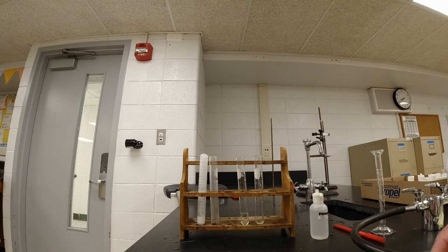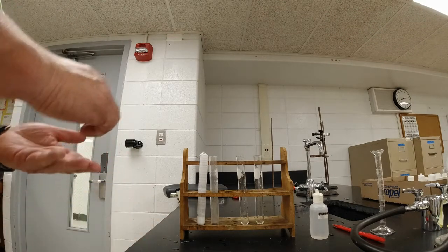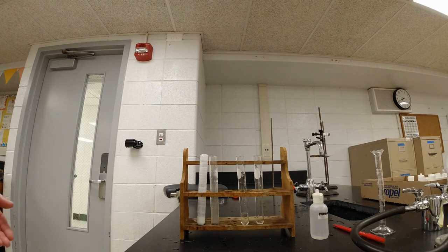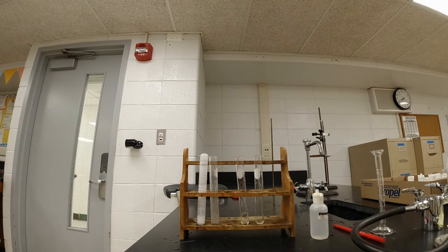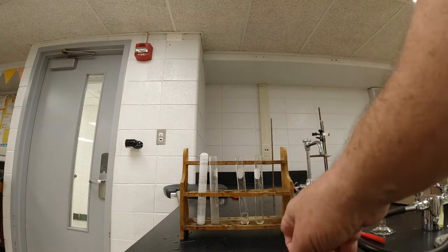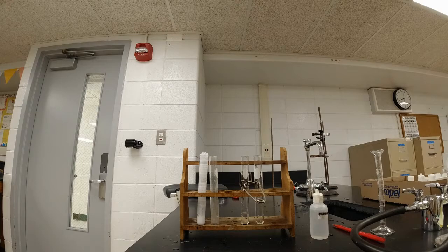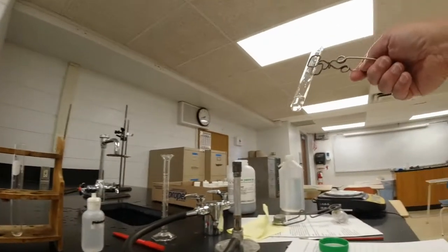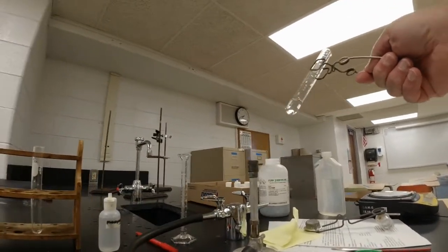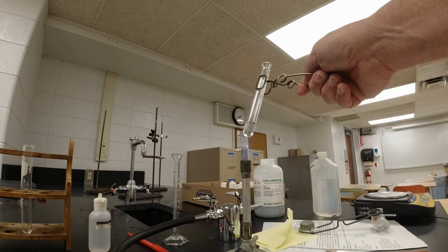Now what I'm going to do, I'm going to put in the magnesium. And magnesium ribbons are little thin pieces, it looks like metal strips. And I'm going to put that in there. And wow, it doesn't really look like anything is happening in comparison. All right? So one of the things to do sometimes to help speed up a reaction is you heat it. And so I'm going to heat this in a Bunsen burner. So let's turn this thing around, make sure I get it in the video this time. And I'm going to boil this. And hopefully that's going to get the magnesium heating.